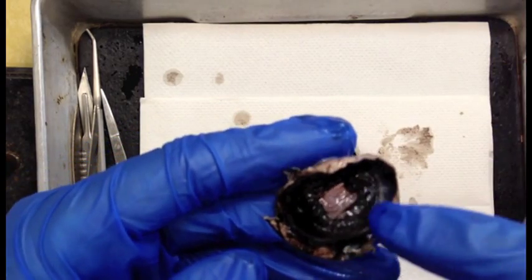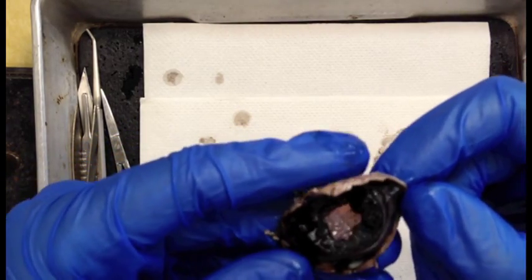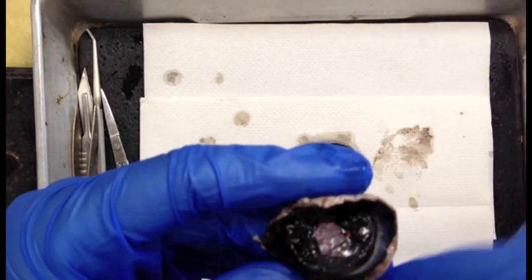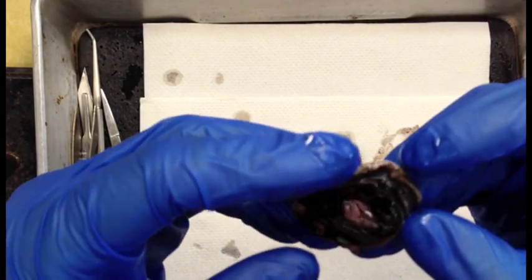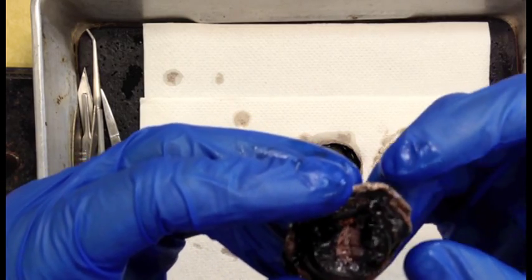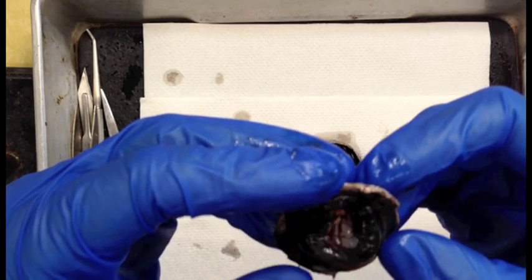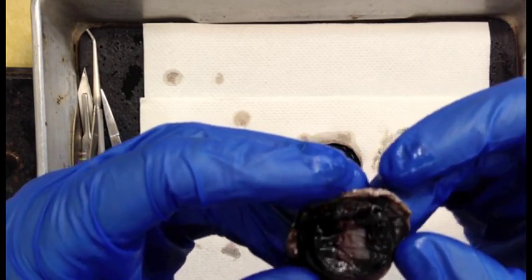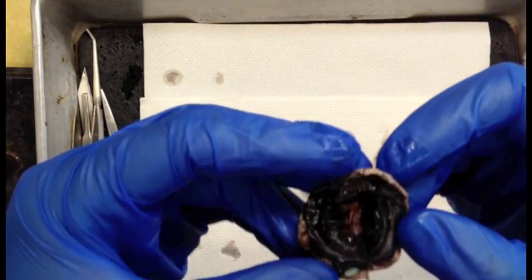And now this center portion that looks clear, that's actually the cornea. We're looking through the cornea from the inside of the eye. And this black ring around it is the iris. And the hole in the middle that allows us to see the cornea is actually the pupil. And the iris is part of the vascular tunic. And also attached to that would be then the ciliary body, which helps support the lens.